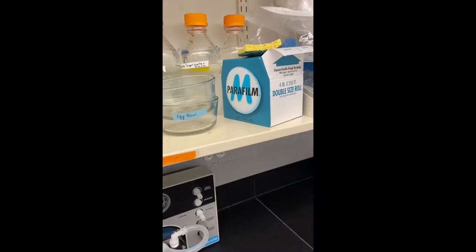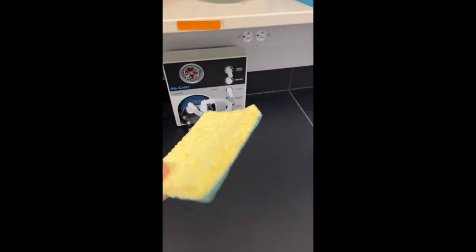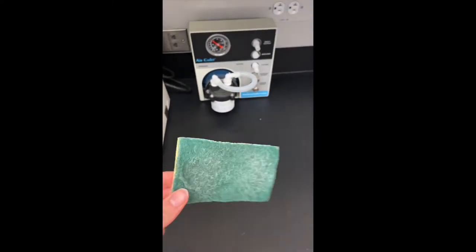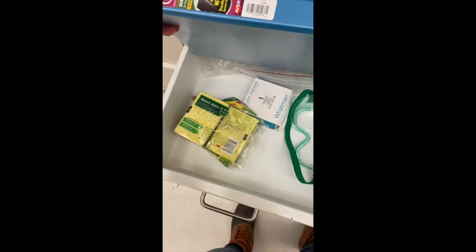To wash the trays, we need this sponge that lives up here on the shelf so it's safe from soap. I change the sponge about every two months, or if I think something got on it that's not supposed to be on it. Extra sponges are in this drawer down here.